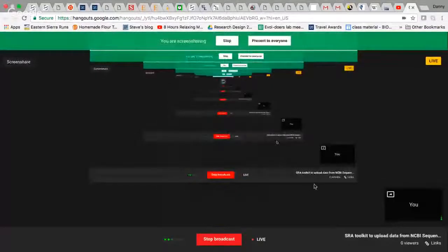I want to put together a series of videos that take you through finding sequence data through the NCBI database, learning how to use the SRA toolkit, which is the Sequence Read Archive toolkit, to procure that data to your local computer, and then working through the HiSat pipeline to work with those sequence data, and eventually, hopefully, we'll get through some differential expression analysis with that.